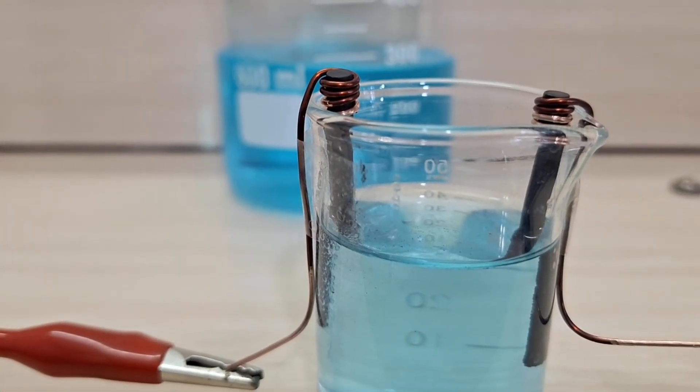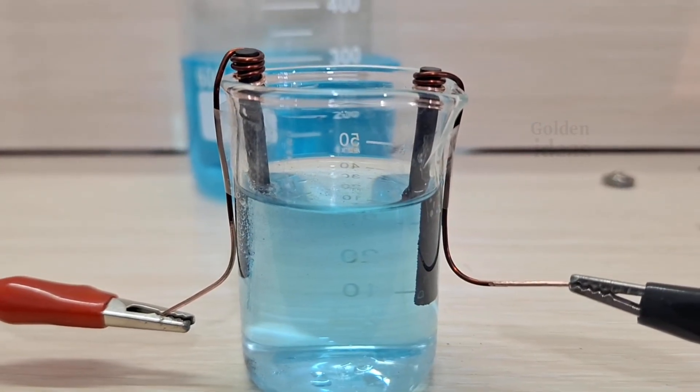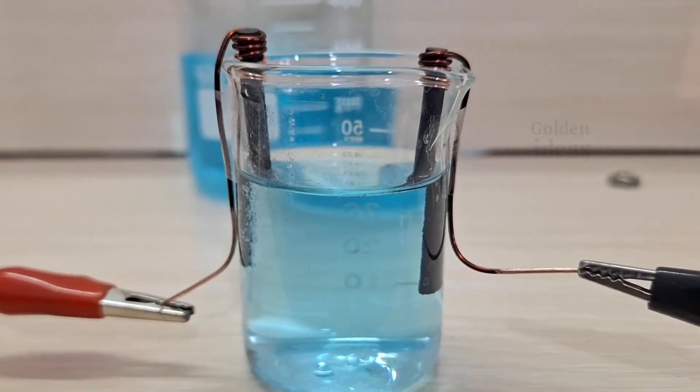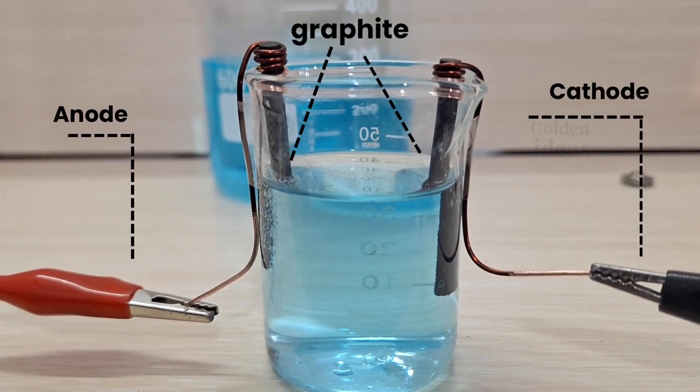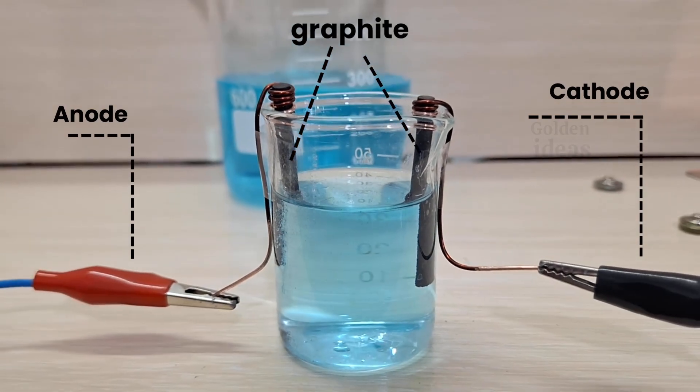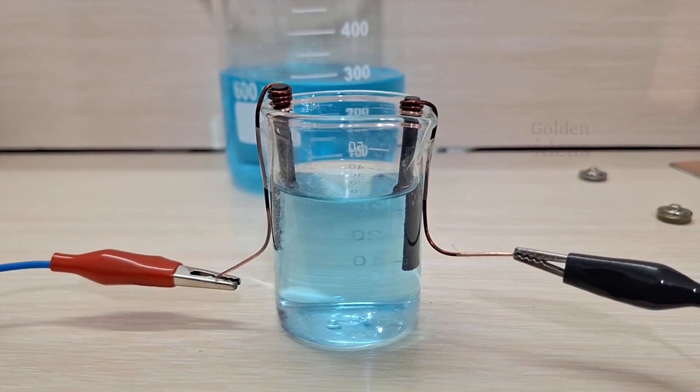So, excessive heating of the solution during electrolysis usually has two main causes. The first is high concentration of the solution, which you can fix by diluting it with distilled water. The second is high voltage applied during electrolysis. Electrolysis should be done in a way that the solution doesn't get noticeably warm.